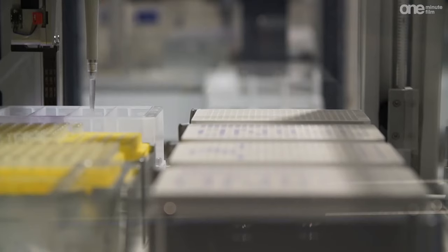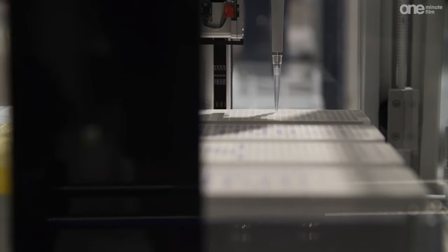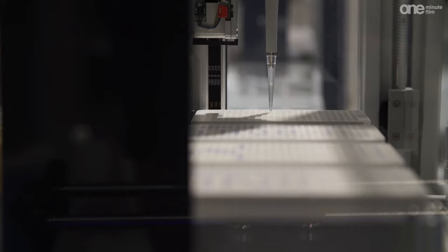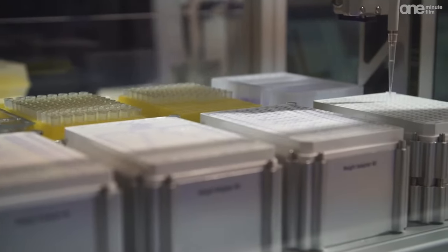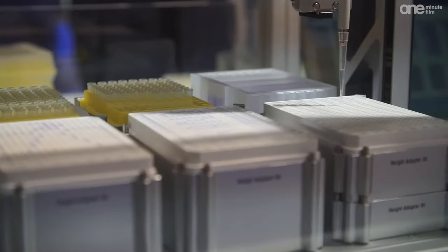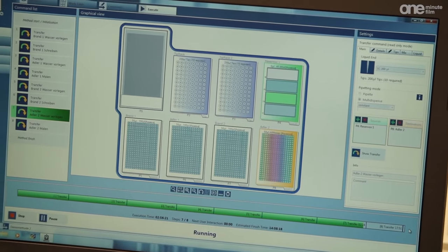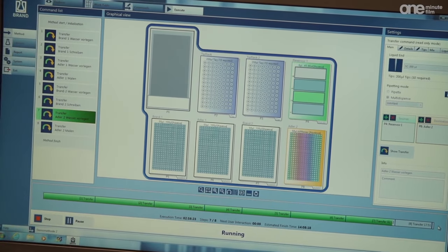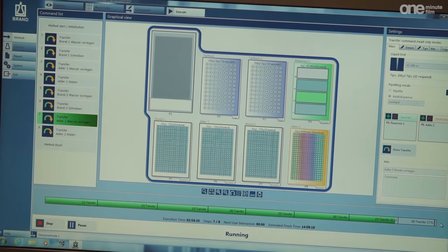The instrument is very compact with a small footprint. It has eight positions in a 60 by 50 centimeter workspace with intuitive and flexible software. The liquid handling station also delivers high precision that is extremely important in dispensing liquids in the previously mentioned disciplines.